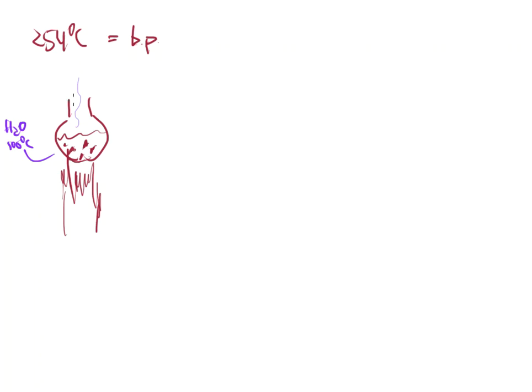And if I've got this thing on a distillation, and I'll show you a picture of that in a minute, but this water vapor is going to come over here, condense back down, and it's going to go into a receiving flask that's going to slowly get filled up with a solution. Well, if I only do this and that's it, I can only go to 100 degrees. That's it. And the problem is that eugenol is at 254.